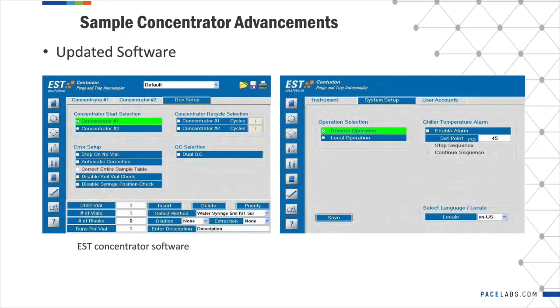Newer, up-to-date concentrators also offer upgraded software. They are no longer controlled by tethered handheld devices, and some even offer Bluetooth compatibility for out-of-lab monitoring. We are now capable of setting and monitoring all flows and temperatures in the concentrator. They come equipped with alarms for any parameter that deviates from the method settings, so that you can immediately fix the concentrator if something happens. With all this, concentrators have better communication between the automated sampler and the GCMS, which helps decrease runtimes by keeping everything in sync.